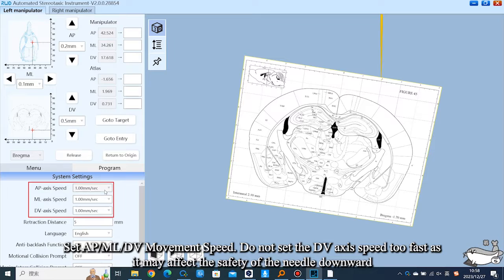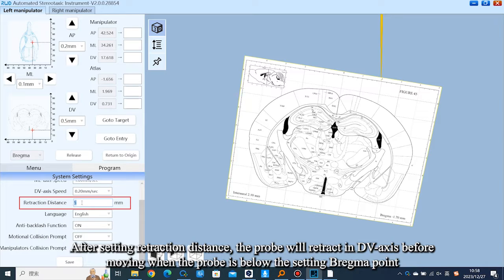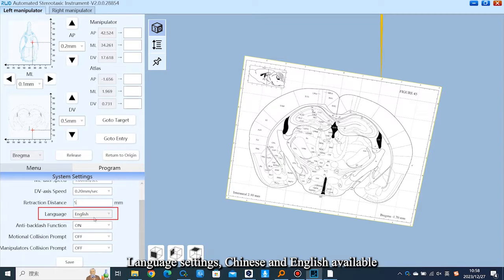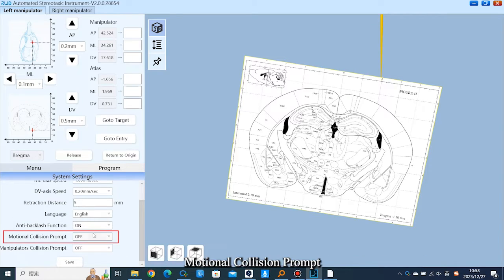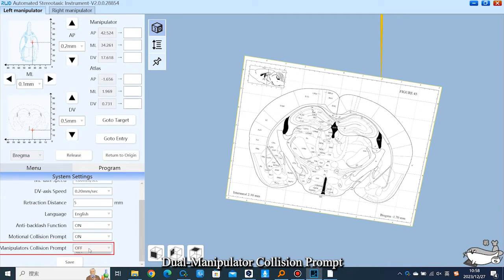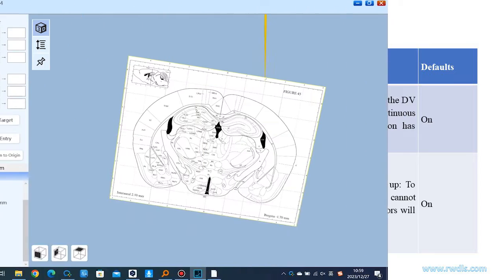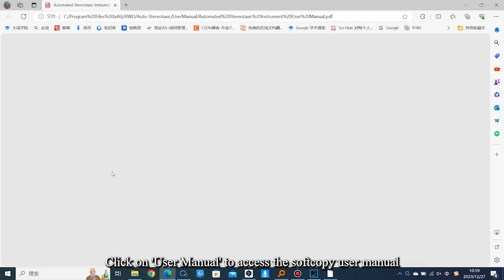System settings allow you to set the AP, ML, and DV movement speed. Do not set the DV axis speed too fast as it may affect the safety of the probe during downward movement. After setting the retraction distance, the probe will retract along the DV axis before moving. When the probe is below the bregma point, the distance between the retraction highest point and bregma's horizontal plane is the retraction distance; range: 0–10 mm. Language settings offer Chinese and English. The anti-backlash function, when turned on, makes the motor automatically move to eliminate backlash and improve accuracy. There is also a motional collision prompt and dual manipulator collision prompt — we recommend turning it on. Click Version to query the software and hardware version and manufacturer's maintenance info. Click User Manual to access the soft-copy user manual.